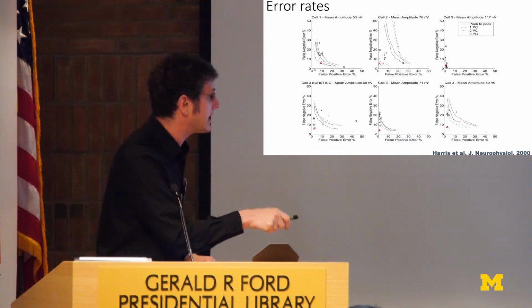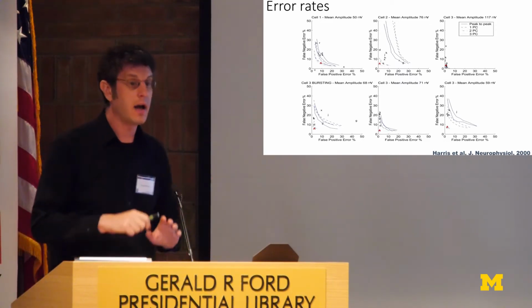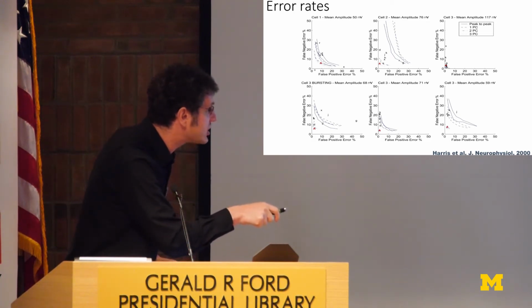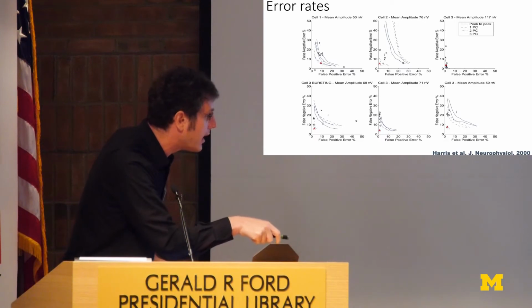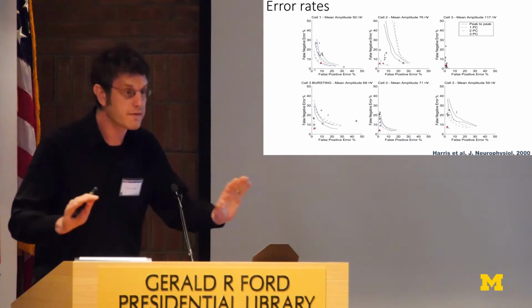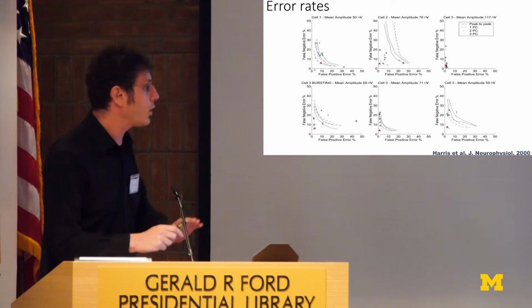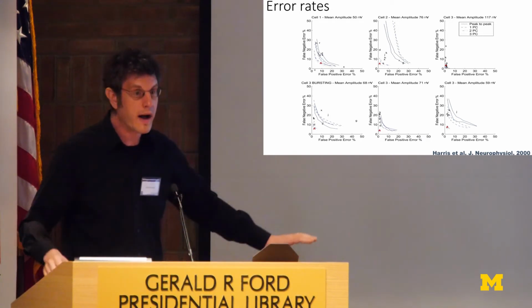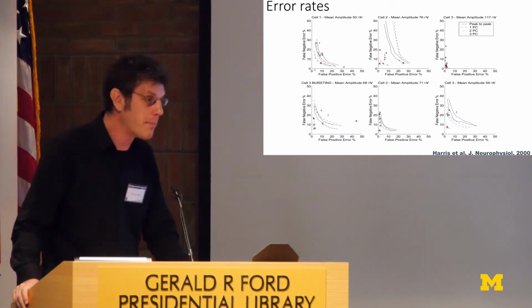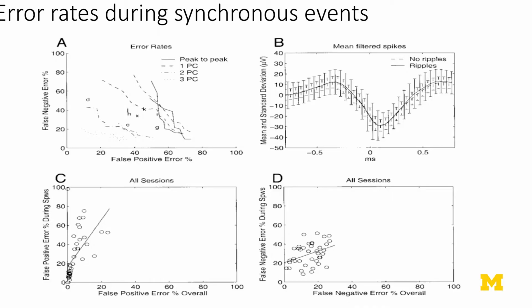And the dashed and solid lines are the optimal performance you could have expected that we knew because we had the ground truth. And if you see the dashed line, it's a bit faint here, but it's normally right underneath the A. And what that's showing is that the automatic method, after manual curation, is performing about as well as it possibly could have. So that was all right for tetrodes, and that's why this is what people did for about 10 years or so, because it works basically about as well as it possibly could have, with a few exceptions. So here's an important exception.